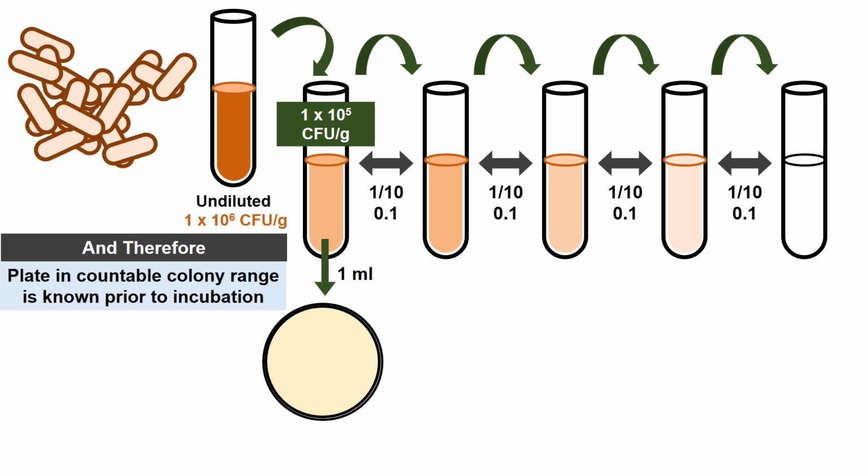So we are looking for the number of CFUs on that plate. And I know the concentration in my tube and the volume I plated. So the question becomes, just like I said a few slides ago, the colony forming units per the volume I put onto the plate. That was the numerator and denominator of our equation for this rule to determine concentration. And I'll put that together on the next slide.